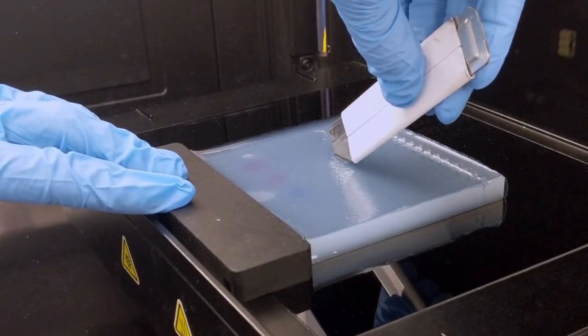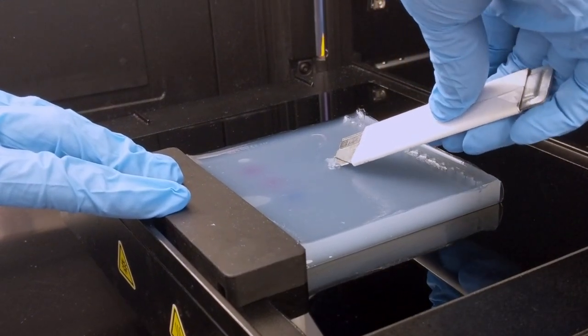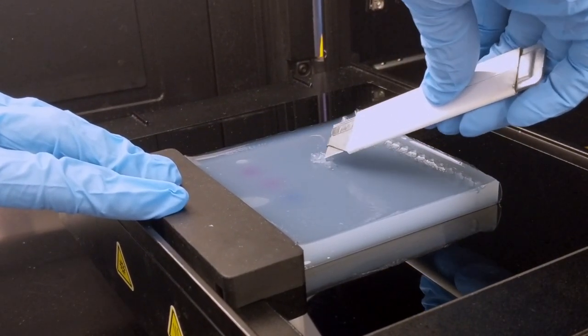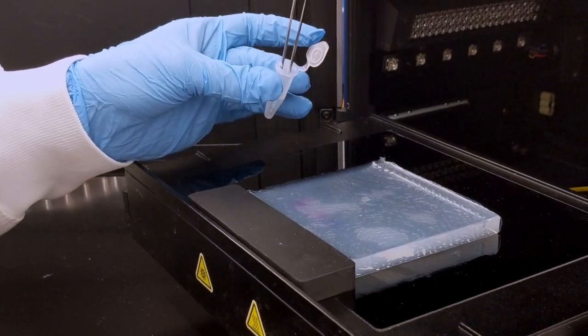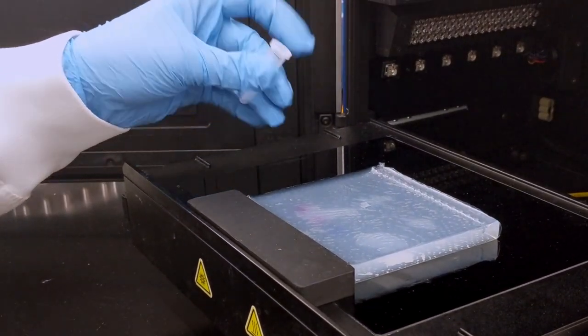When you have successfully cut around the band, separate the extracted piece from the rest of the gel and place it into a microcentrifuge tube. Use sterile tweezers or a sterile pipette tip to carefully maneuver the gel piece into the tube.